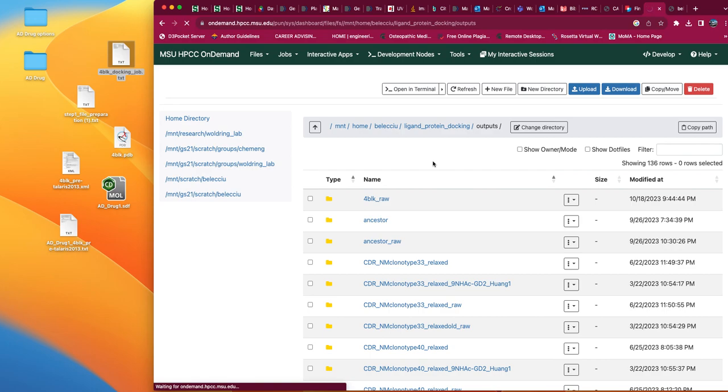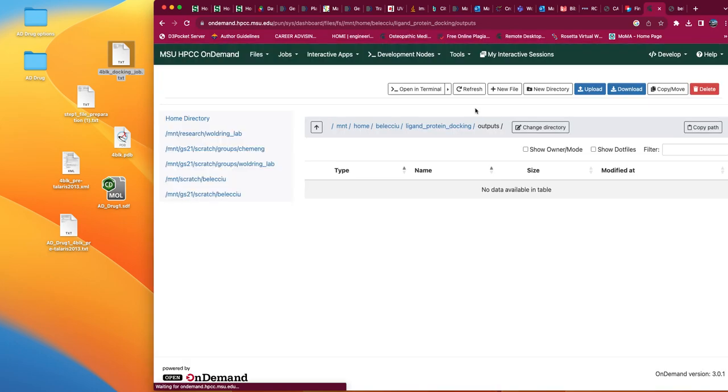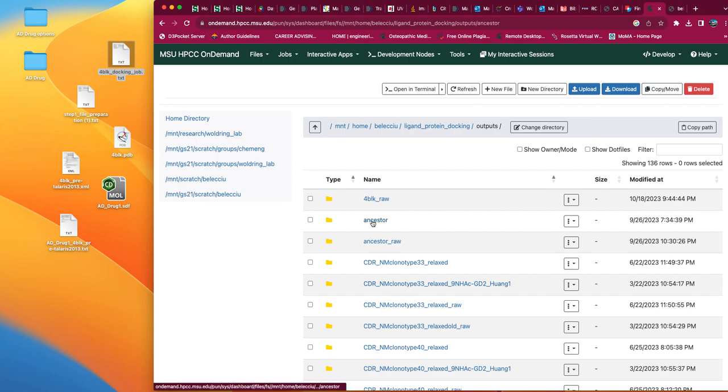Anyway, once you have the full list of however many thousand outputs you're going to have, there's a third Python script called step3 dockingdocs.py that will go through that. It will find a score file. Rosetta will output a score file for the entire docking run, which will list the Rosetta Energy Unit scores for all of the docking outputs. And the lower that score is, the better it is. It's analogous to free energy. So it will find those and sort them based on the interface delta X scores.